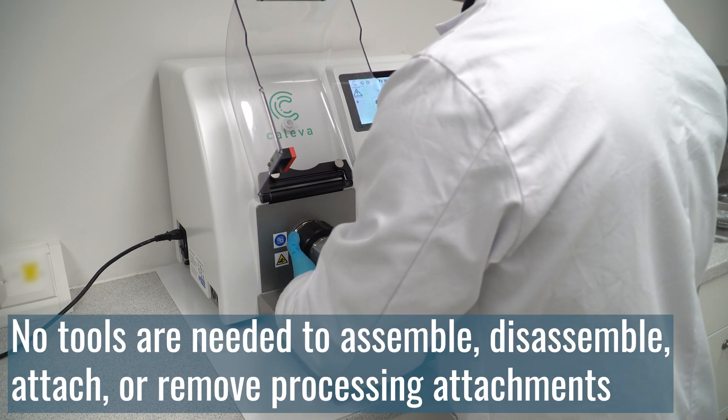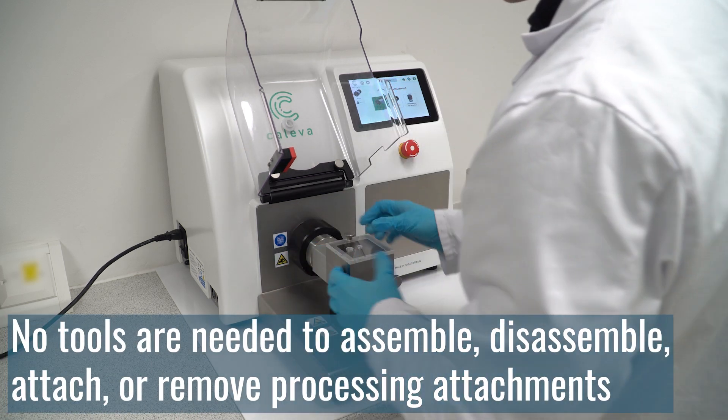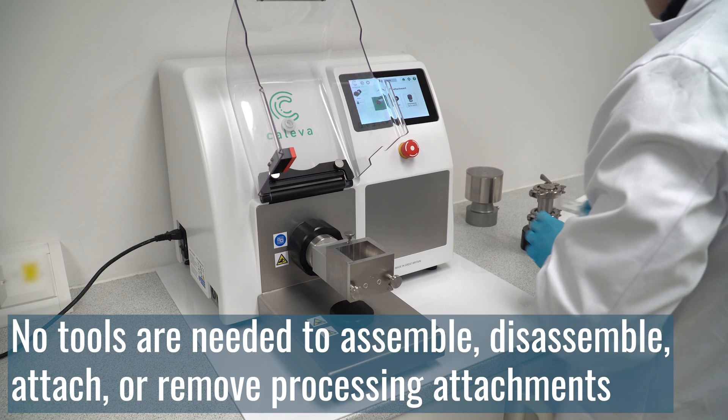Each attachment has been designed to require zero tools to assemble, disassemble, attach or remove, ensuring ease of use for the operator.